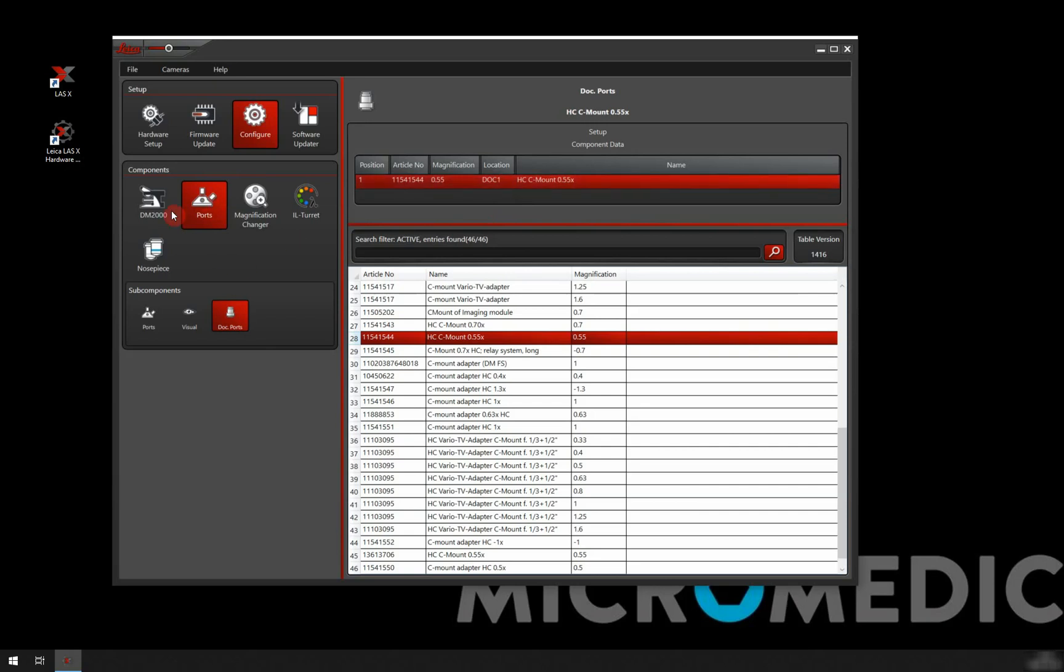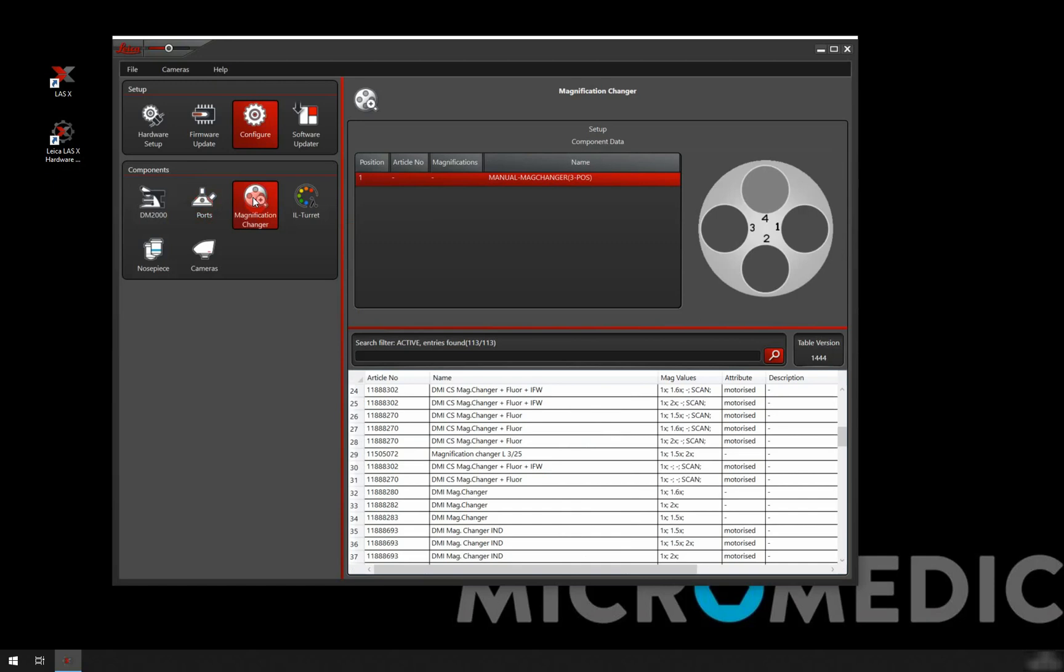So that's our ports. Magnification changer always comes in here, but if you don't have any, then you don't really have to do anything here. We can just move on. I don't have one.